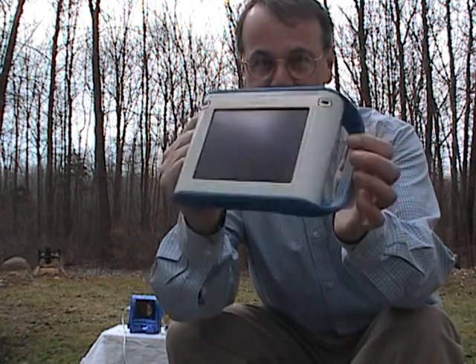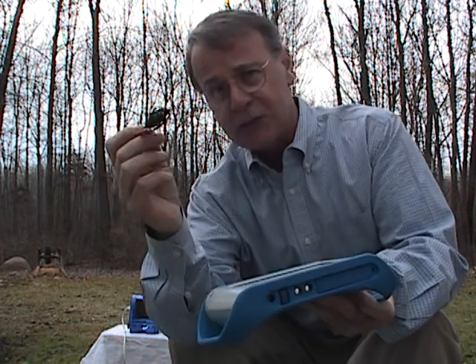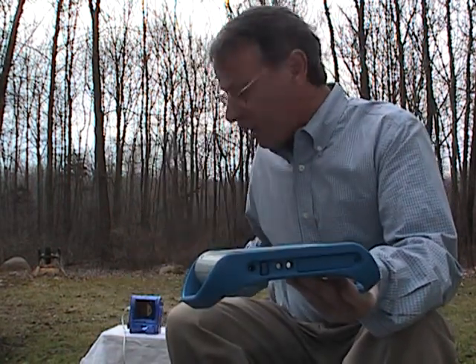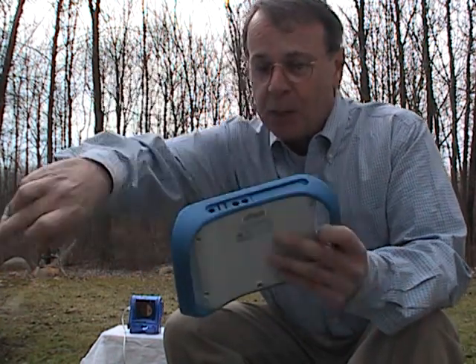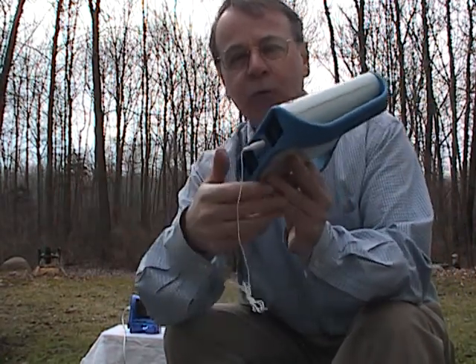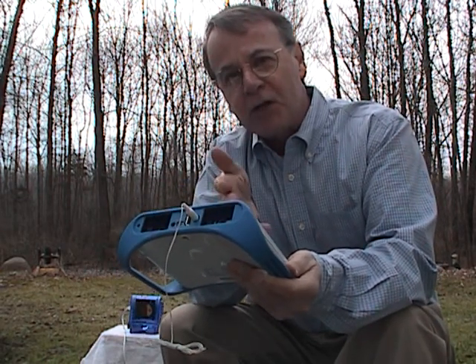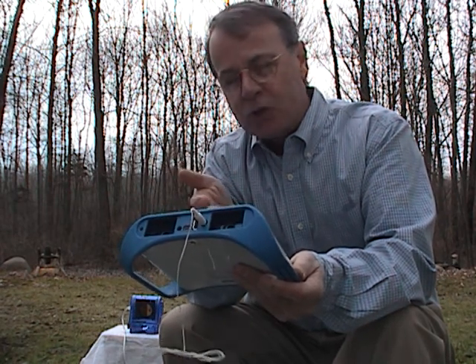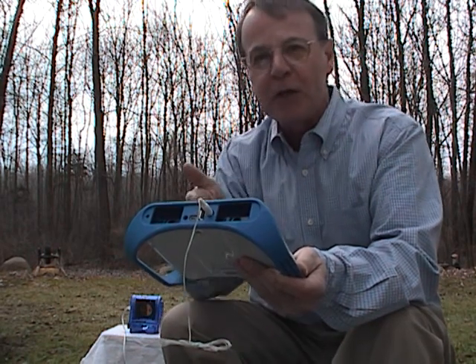It has great handles on it and it's really kid-friendly. It comes with some great sensors — this one happens to be voltage and this one is temperature. Beats those old-fashioned thermometers we used to use. You plug it in very simply in the back, and right now I'm collecting temperature on the machine. I'm seeing fluctuations — it's 20.8 degrees Celsius, 20.5 degrees Celsius — seeing the fluctuation as it occurs.